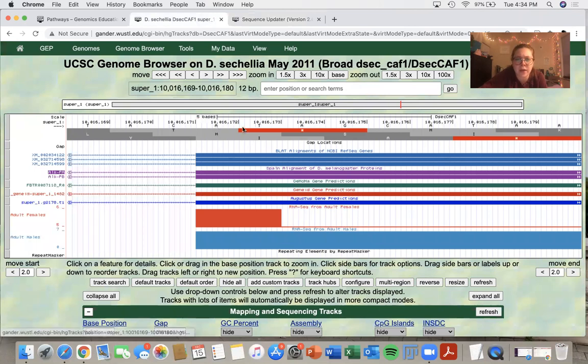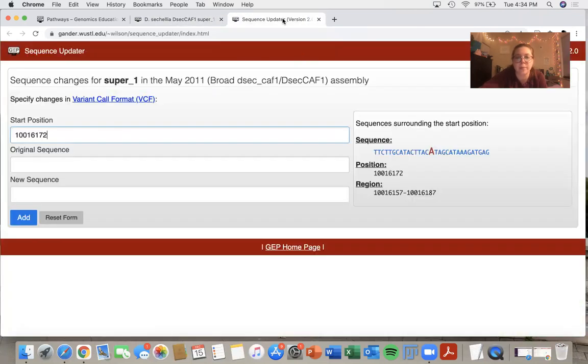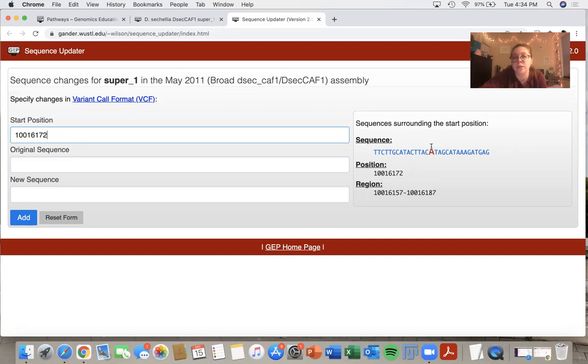So I have A, T, A starting at the base. And that base is A, T, A. And it also shows me a range around the position that I'm looking at.